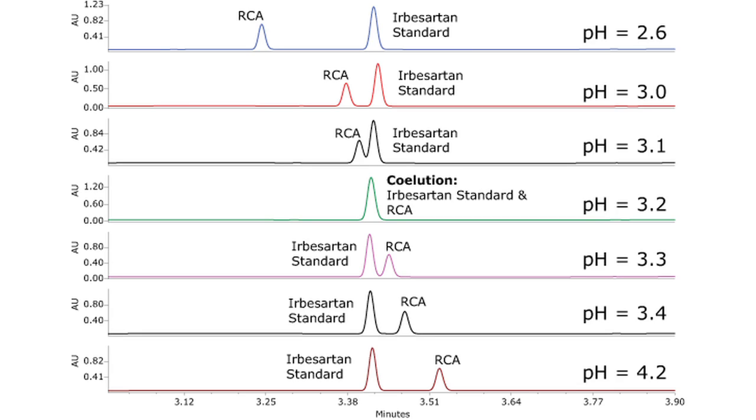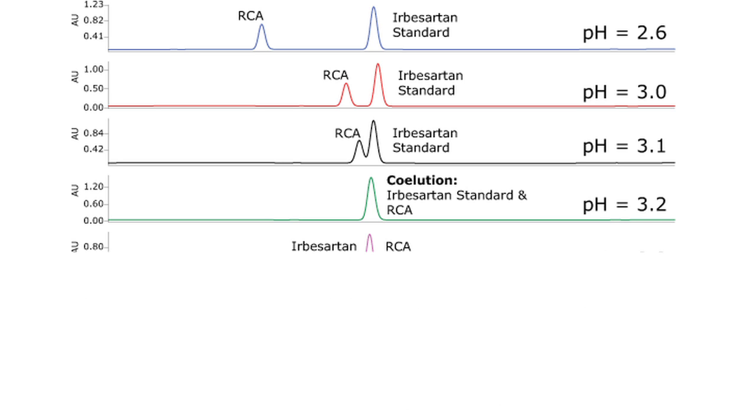In this example, which is based on a USP method, you can see the dramatic changes that can occur with small modifications of pH. Elution order can change over a range of just 0.3 of a pH unit, and if you inadvertently choose the wrong pH, you'll see coelutions.